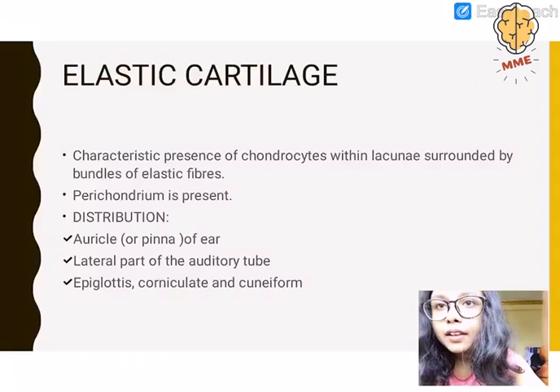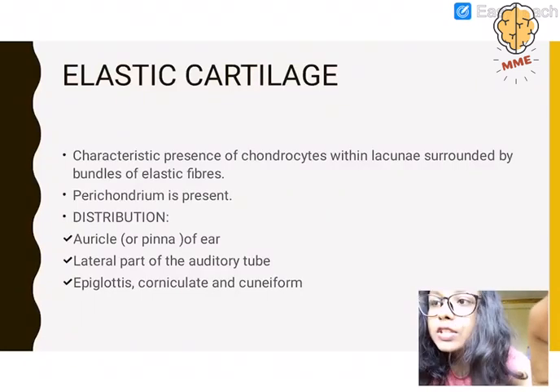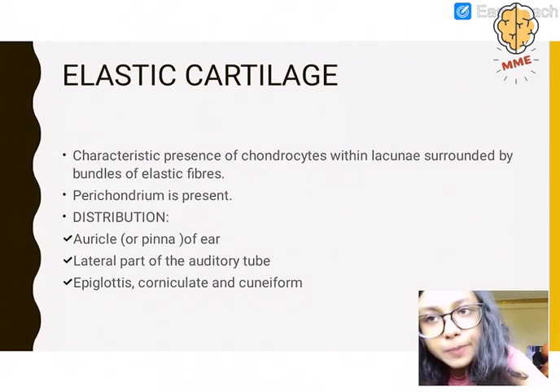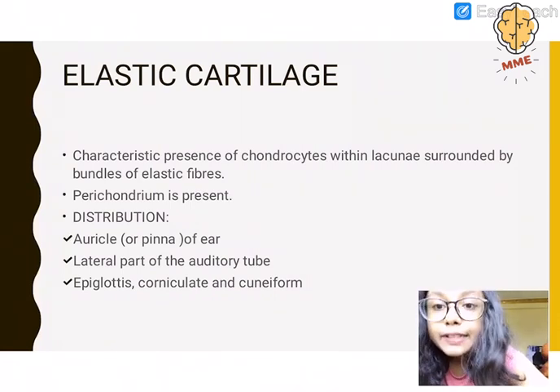Now coming to the elastic cartilage. Here the characteristic is that the chondrocytes will be within the lacunae, but they will be surrounded by bundles of elastic fibers.